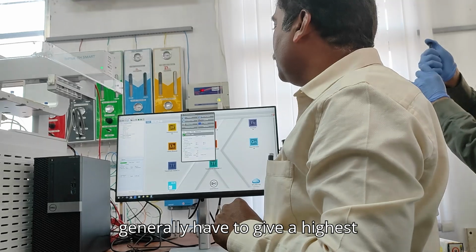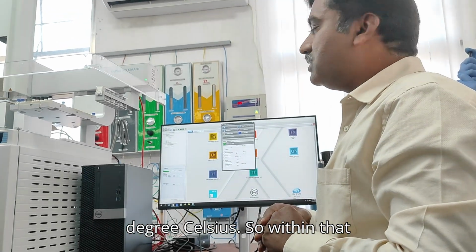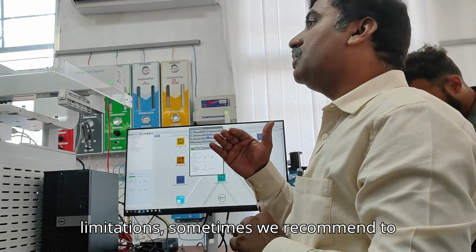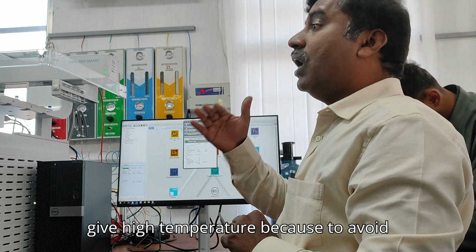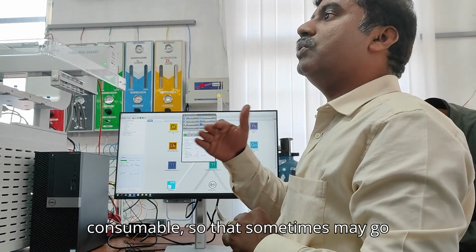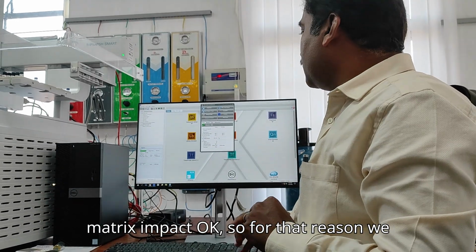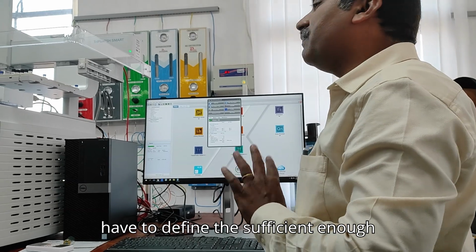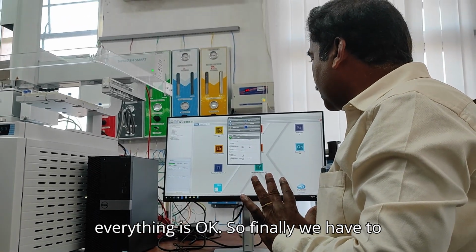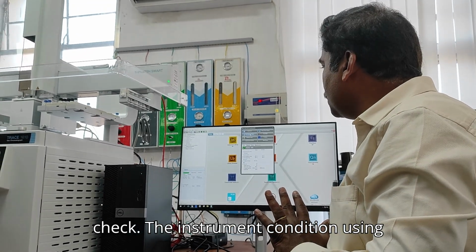We generally have to give a high temperature, goes up to 280, 300, 350 degrees Celsius. Within those limitations, sometimes we recommend a high temperature to avoid source contamination. Source is also a consumable, so it may get contaminated because of the sample matrix impact. For that reason, we have to define a sufficient temperature, and then the vacuum level, everything is okay. So finally, we have to check the instrument condition.